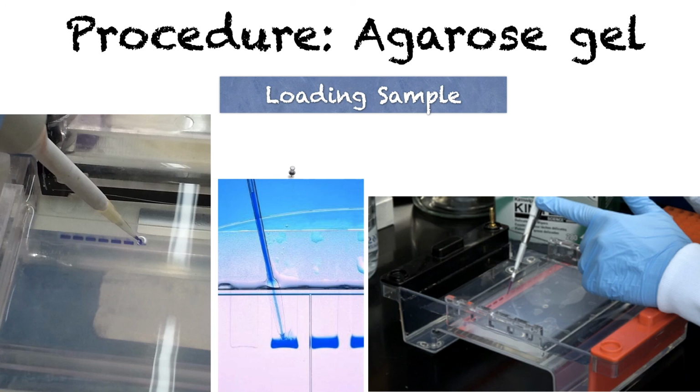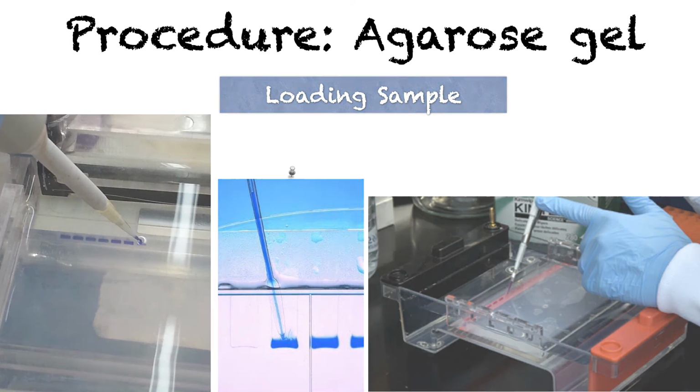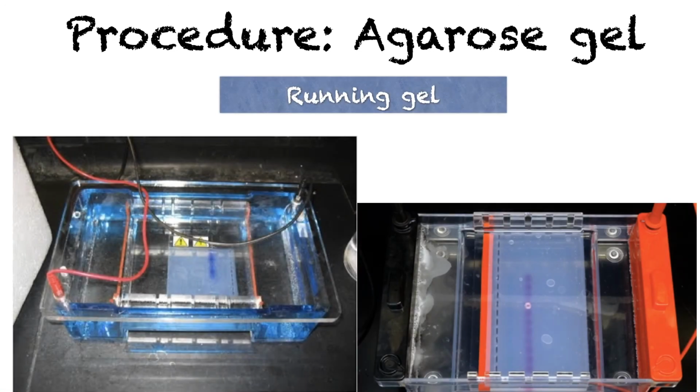So it creates the chance to mix up and contaminate the other samples. So loading gel is critical. And after we load the gel, what we do is we run the gel.